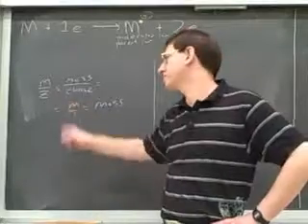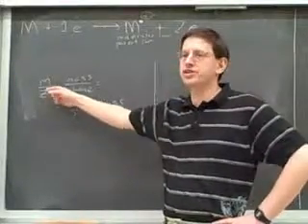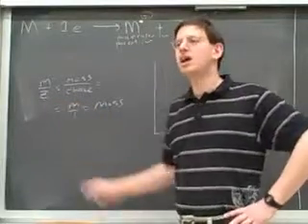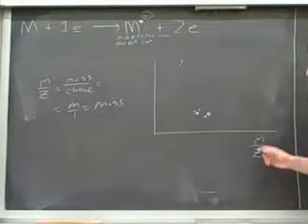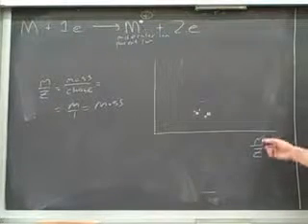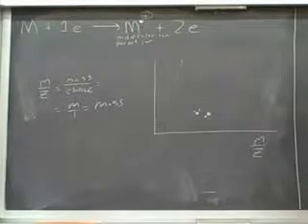Since almost all of the particles we're shooting through will have a charge of 1, for all practical purposes, we can think of M/Z as just telling you the mass. We have to call it M/Z because that's what you'll see it referred to in the problems. It'll be called the M/Z ratio, but since Z is just going to be 1, it's really just the mass. It tells us what the mass is.